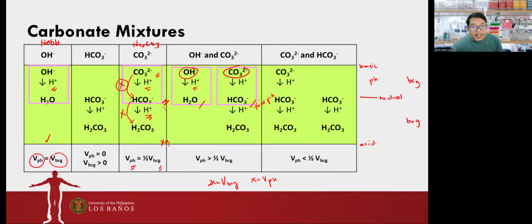Okay? Next naman is, what if we make use of the bromcresol green lang? Okay. So sa bromcresol green, ayan. So as you can see here, si bromcresol green kaya niyang i-react yung nasa basic tsaka acidic region ng ating mixture.